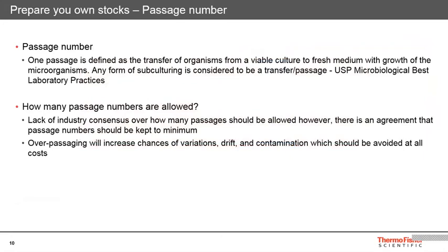The United States Pharmacopoeia, USP, offers a very clear definition of this, and they suggest that any form of subculture is termed a passage. However, when you transfer the organism from a plate to a frozen vial, that will not be counted as a passage. However, upon thawing the material into a fresh plate, that will be a passage.